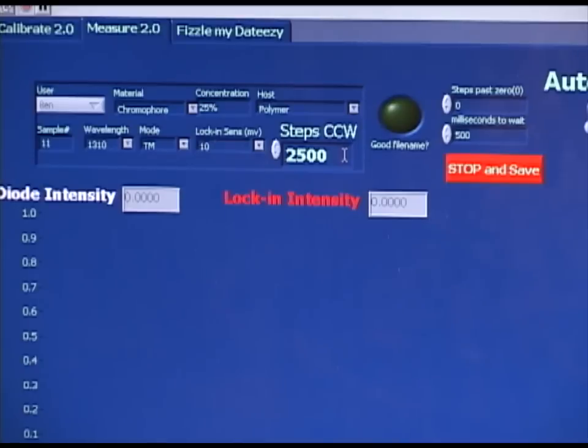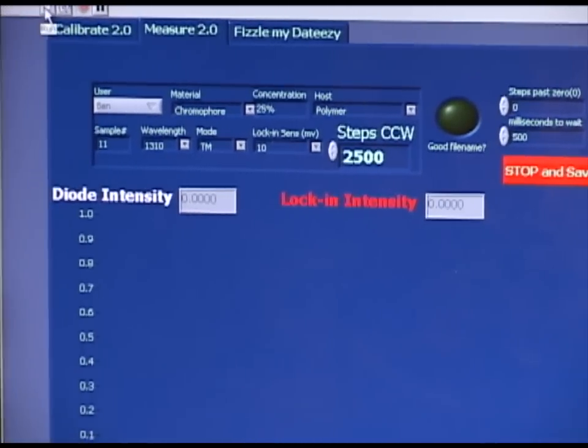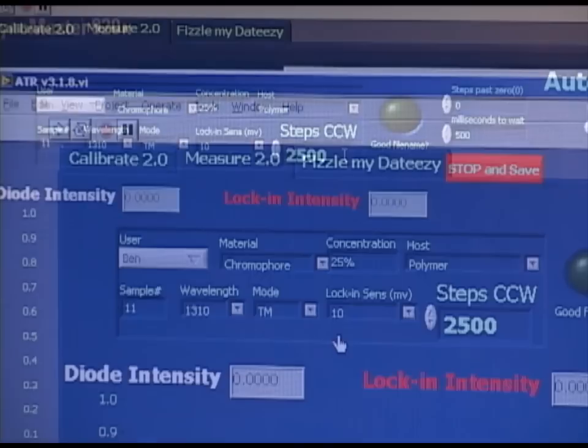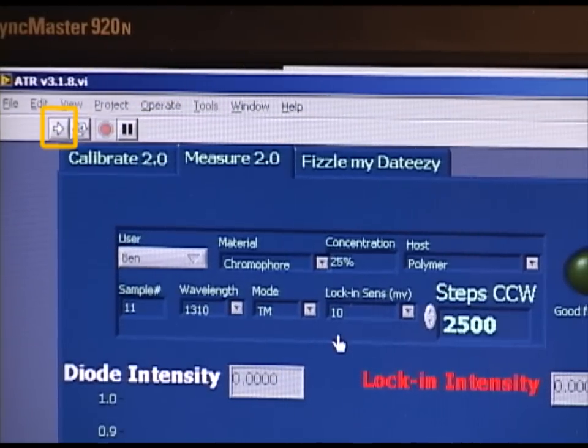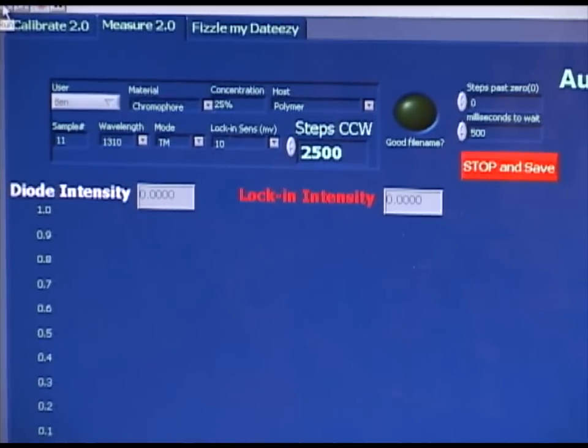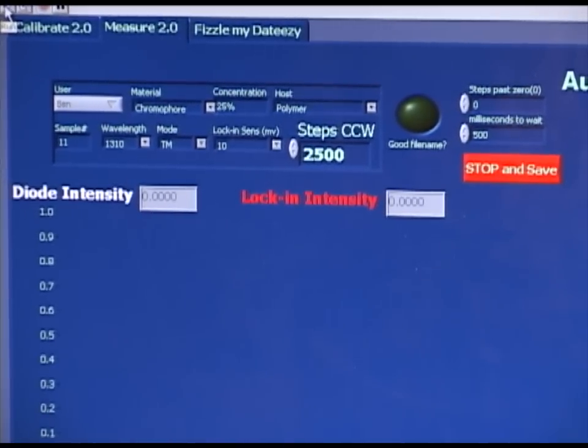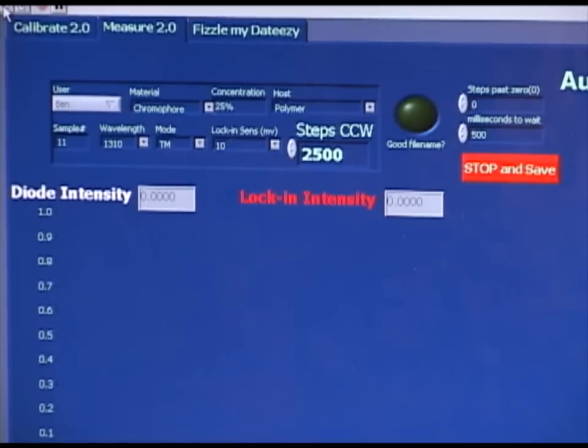Once the information has been inputted, the instrument is ready to begin measuring. To do this, we click the Run button in the upper left-hand corner and the stage motor will begin rotating very slowly across a range of angles indicated by Steps Counter-Clockwise, searching and recording modes that it encounters.